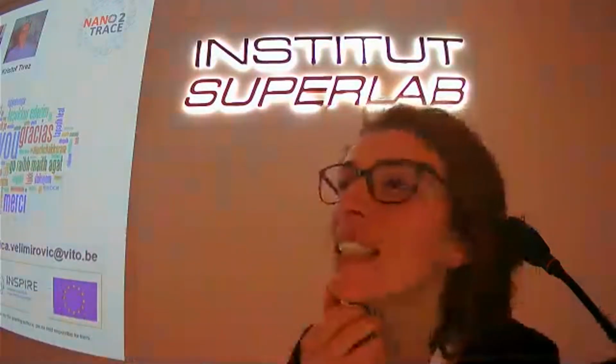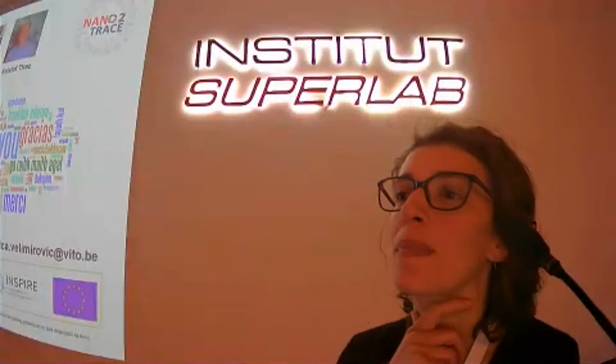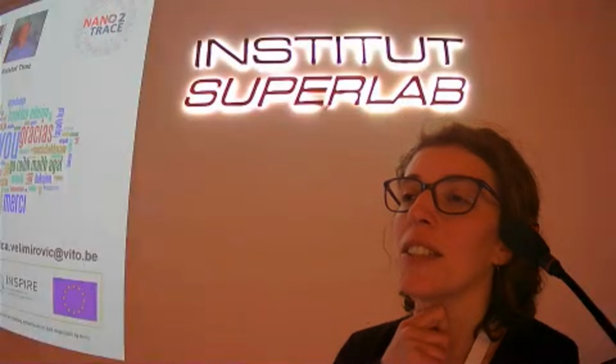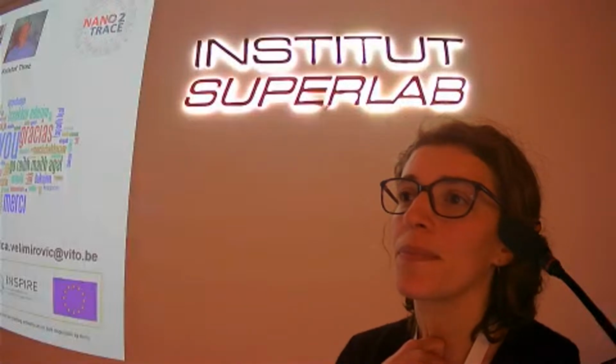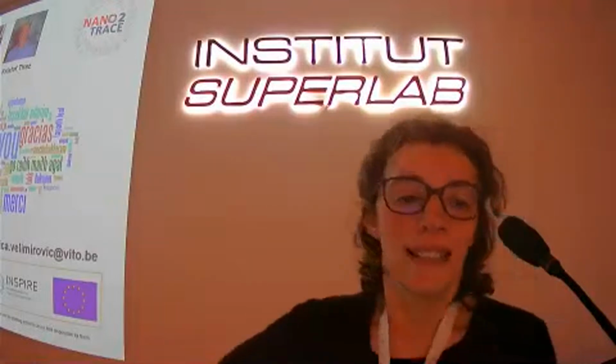Just a quick question about the UV weathering. Is there a standard definition for how you weather polymers? I'm interested because a lot of the FTIR libraries that we base these on are non-weathered polymers, and it was something that I was thinking of doing, but I'm wondering if there's a standard definition for how they should be weathered.